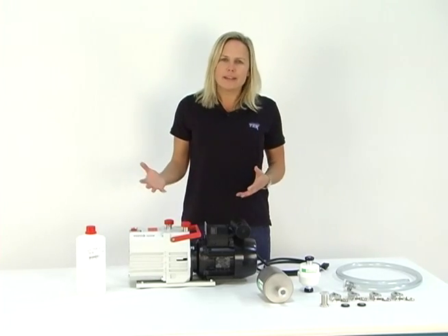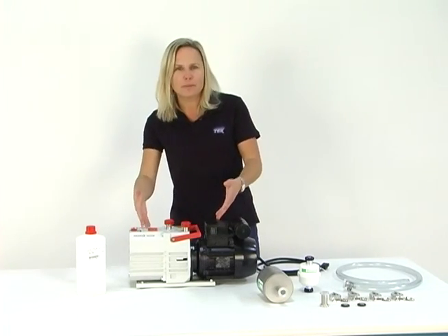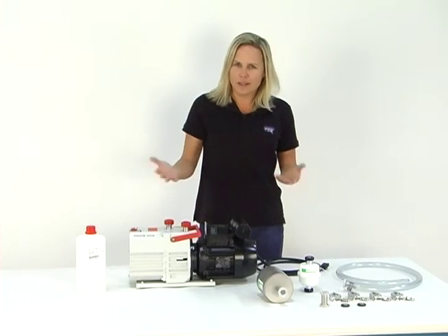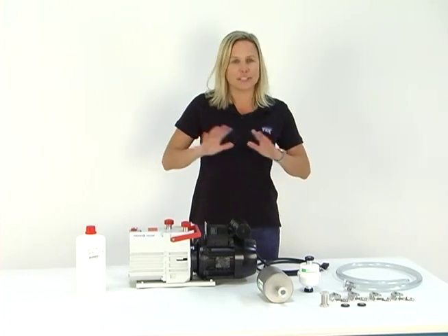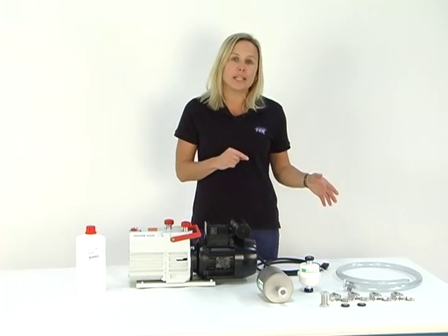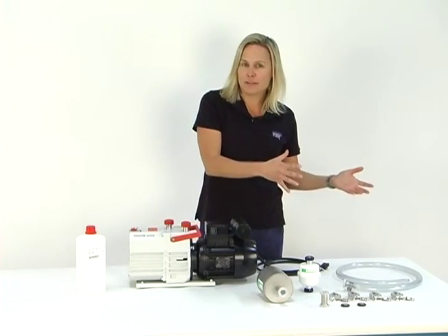People ask me all the time, Mary, how do I connect my vacuum pump to my vacuum oven? Well, we've made it pretty simple. We offer what's called a connection kit, and it has all the pieces and parts that you need to connect your vacuum pump to your vacuum oven.